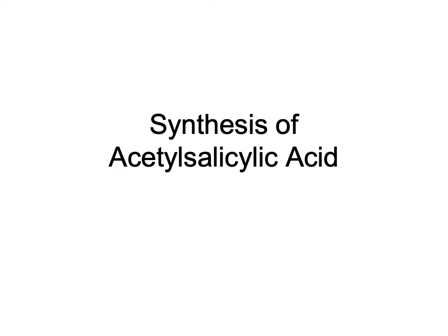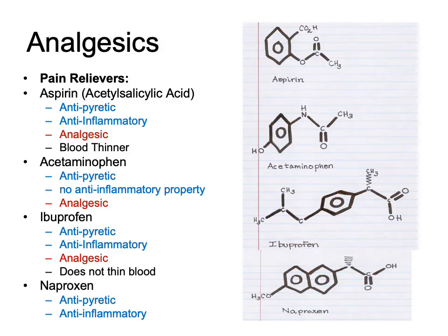Hello everyone, in this session we are going to discuss the synthesis of acetylsalicylic acid. These are the products that we can produce through the organic lab. This week we are going to start with aspirin, acetylsalicylic acid.